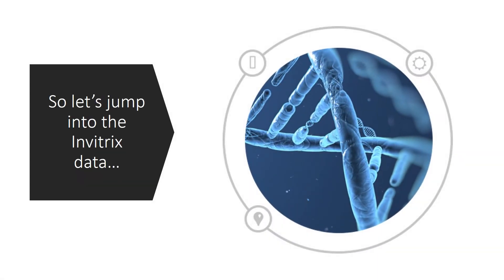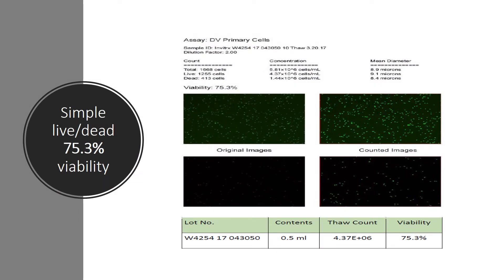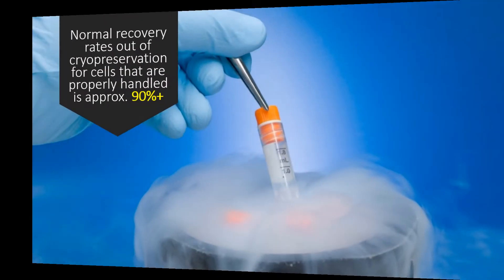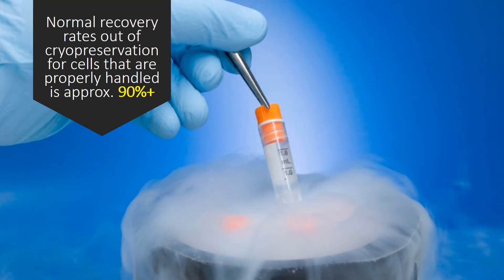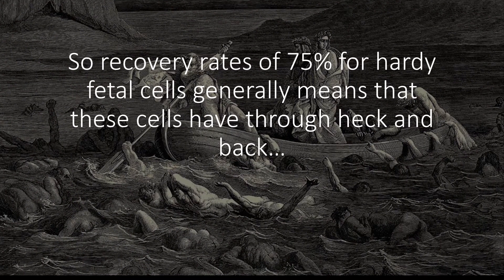So let's jump into the Invitrix data. First, we see a simple live-dead stain with 75% viability. The problem with that viability data is it places healthy and dying cells into the exact same category, so we have no idea what we're dealing with. Normal recovery rates out of cryopreservation for properly handled cells are 90% or higher, so seeing 75% tells you there are issues — basically that these cells have been through heck and back.